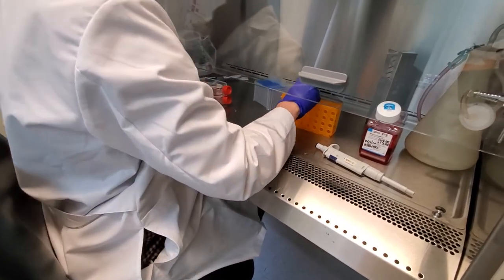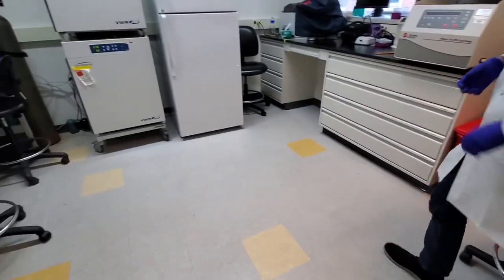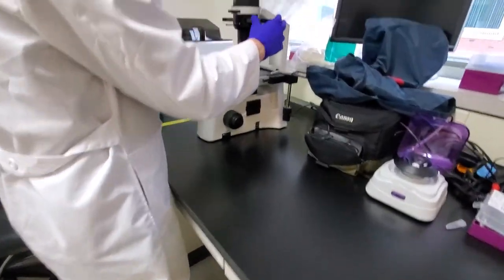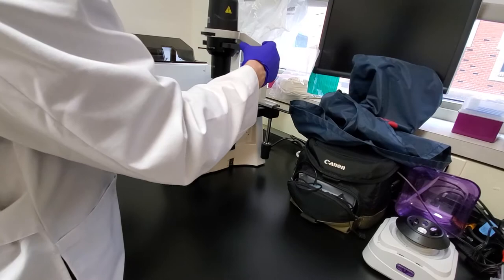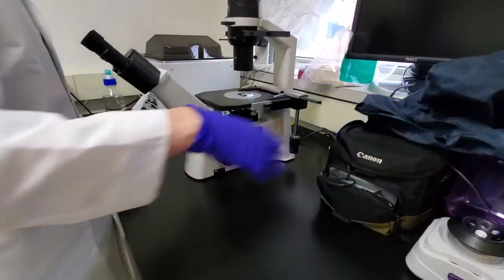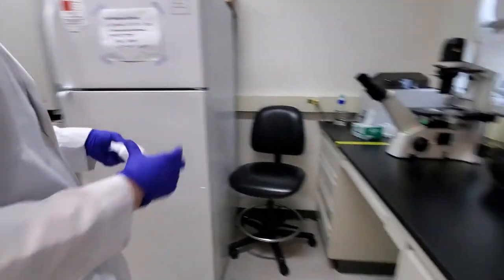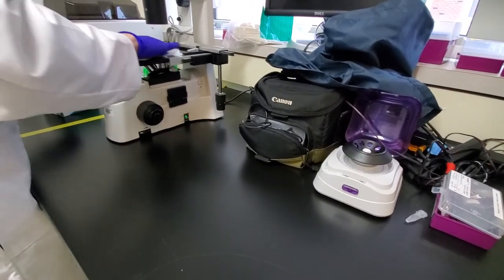Distributed. All right, at this point, we can look at them under the microscope, but they're just going to be floating. I can come back and check later today, and in a few hours they should be appearing. I like to use the phase contrast. Other people like to use the bright field. So this filter is for the phase contrast. Turn that on, 10x magnification. Just make sure this is covered when we're not using it, and then I'm going to wipe down the stage and handles with ethanol, just because we're going outside of the hood. We try to keep this microscope for tissue culture only and keep it pretty clean.